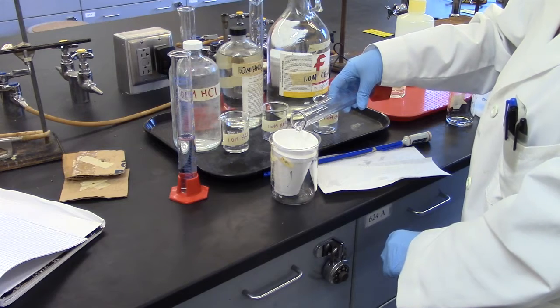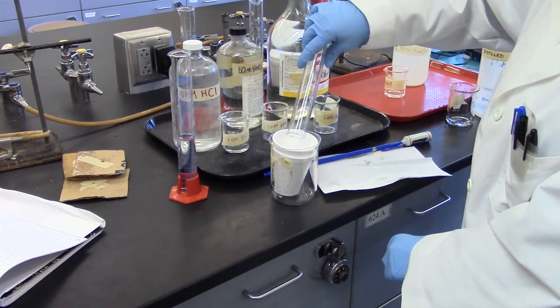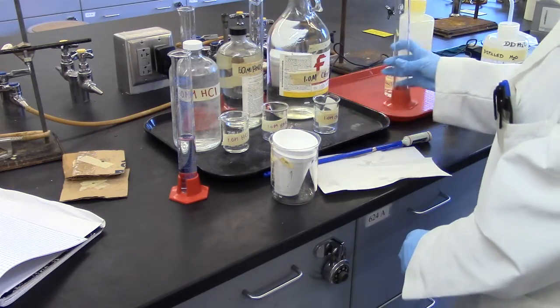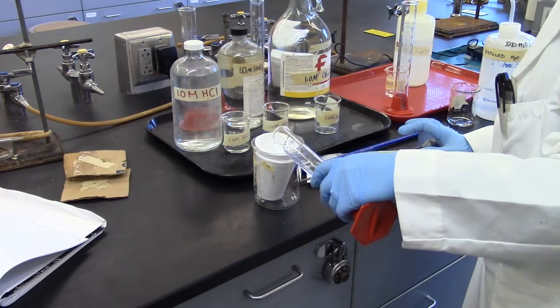Pour the sodium hydroxide solution into the calorimeter. Now add the hydrochloric acid.